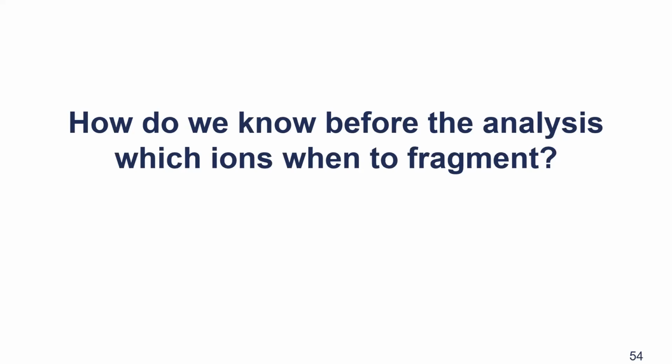So why are we showing you all this detail here at the beginning? Well, first of all, to give you an introduction to mass spectrometry, but also because we think it's quite essential to understand many of these settings to yield the best data at the end, to then make use of all the fantastic computational tools we're going to show you right now.